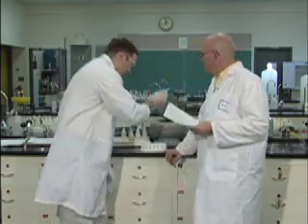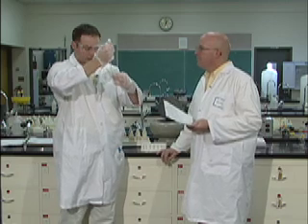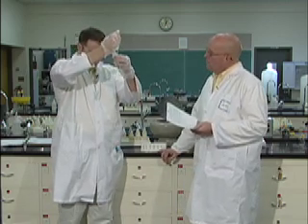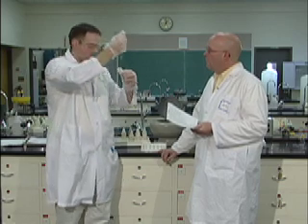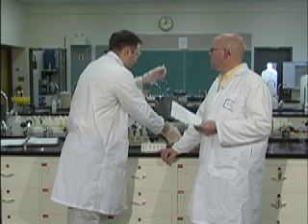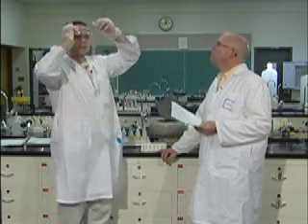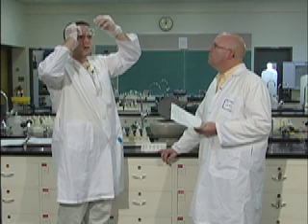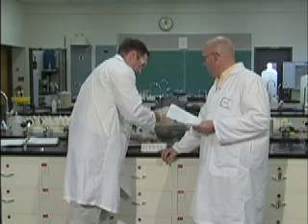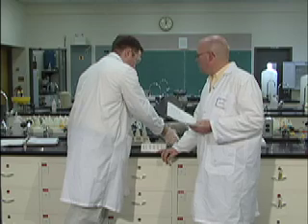You've done this before. A few times. And you know which one you're putting the decant in. I'm keeping mental track of it. Now sometimes you will lose a little bit up into your tube. It's not a big deal as long as you have a little bit of solid left in the bottom. Which we don't. Sorry about this. Should have been more careful. That's okay. It'll still work.